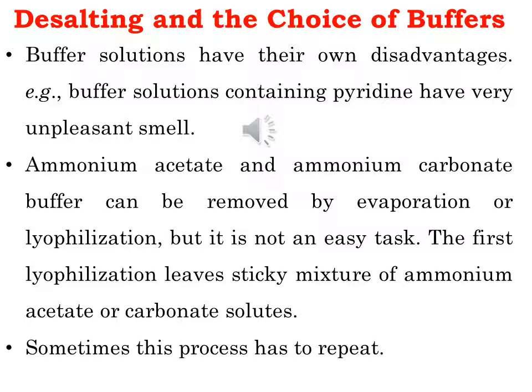Others have reported the use of a buffer solution that is a mixture of pyridine, acetic acid and 2,4,6 collidine that has a pH of 8.3. Some others have used a buffer solution that is a mixture of pyridine, acetic acid and N-ethyl morpholine that has a pH of 9.3.